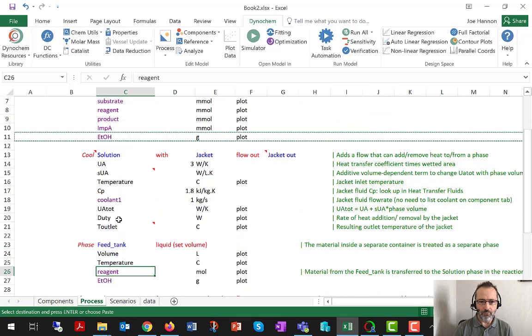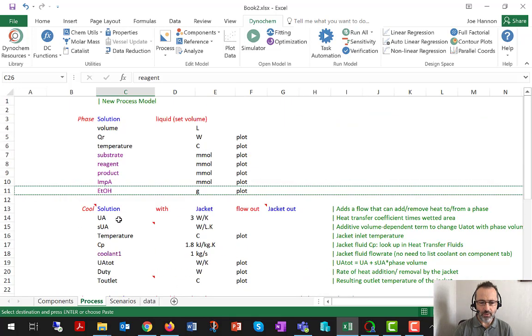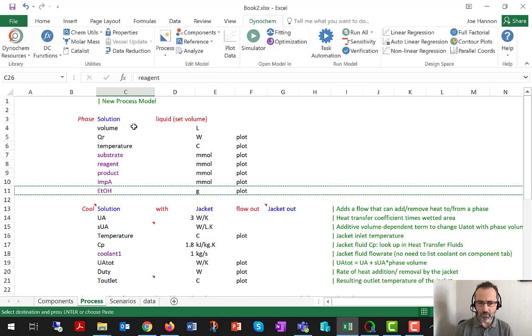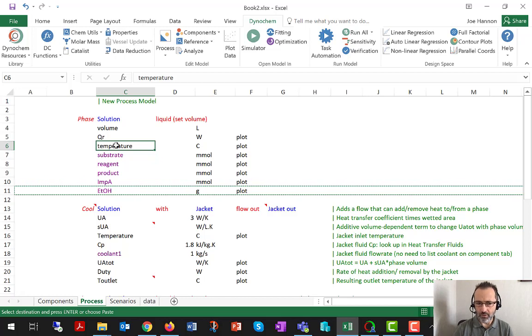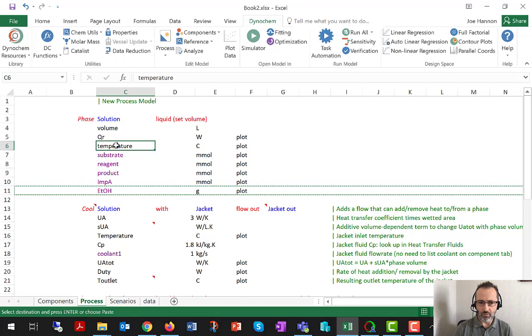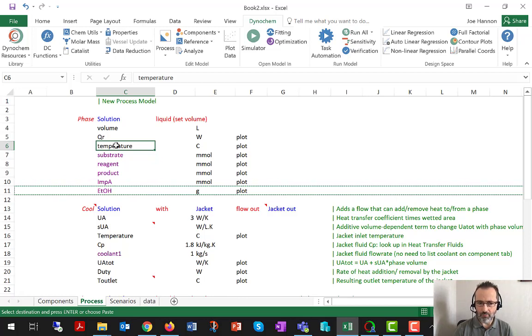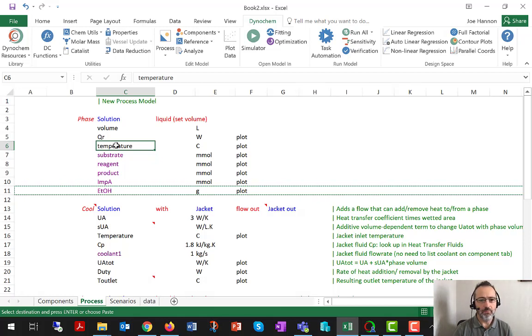And the final best practice is in the absence of any other information for overall phase variables like temperature, for example, or pressure, Dynachem makes some default assumptions. Like if no other temperature is provided, it assumes 20 degrees. If no other pressure is provided, it assumes one bar. If no other CP or heat capacity is provided, it assumes the properties of water.